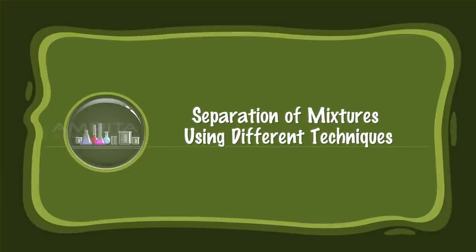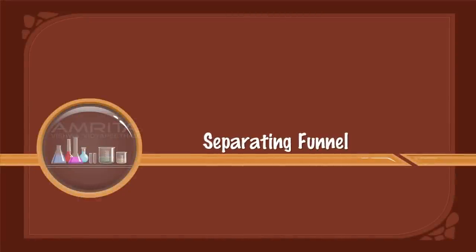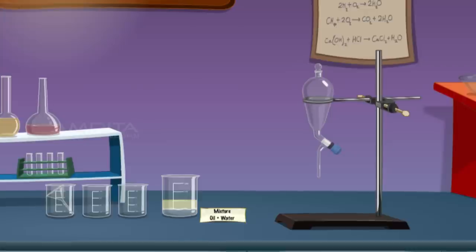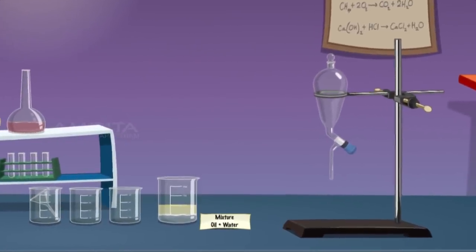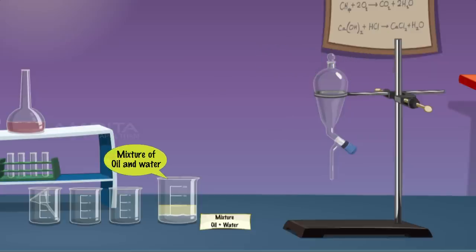Separation of Mixtures Using Different Techniques. Separating Funnel. To do this experiment we require a separating funnel, stand with a clamp, mixture of oil and water, filter funnel and beakers.